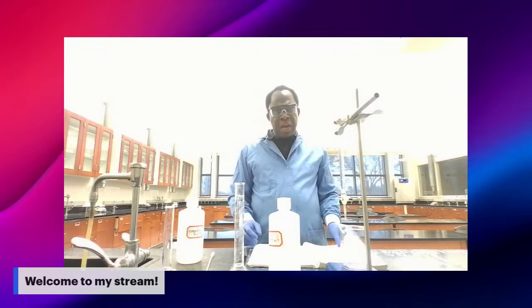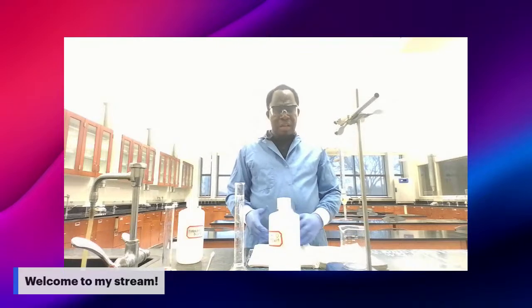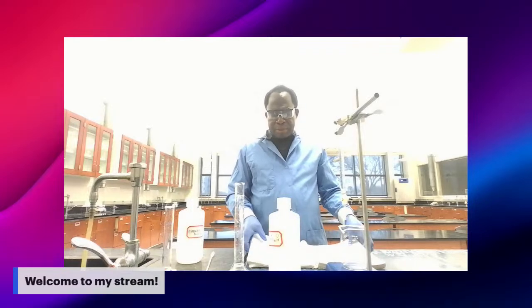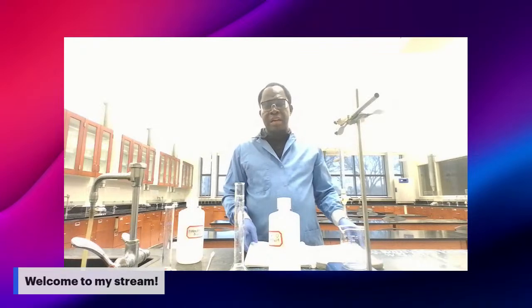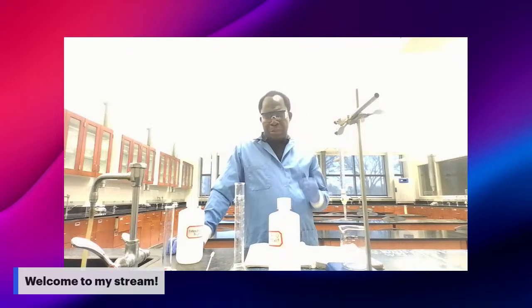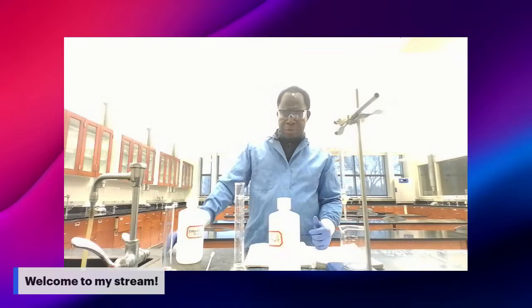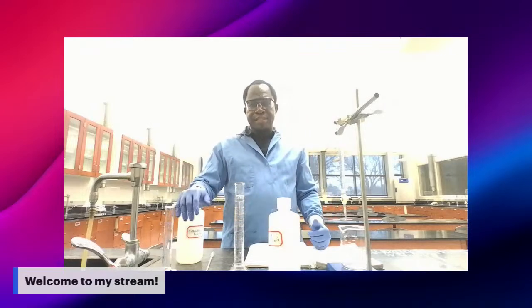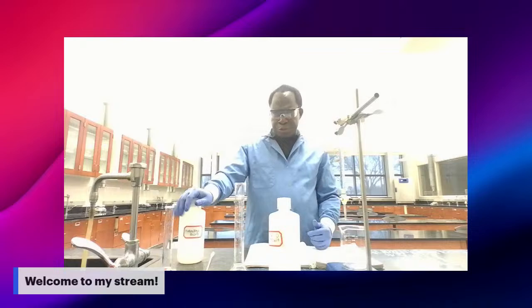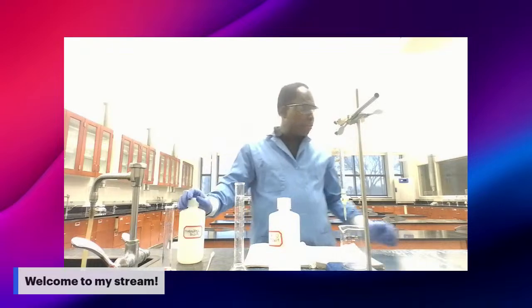Now let's move to the procedure, step by step. This lab has 3 parts in the procedure. Part 1 is to prepare your unknown acid. Part 2 is to prepare your pH meter.